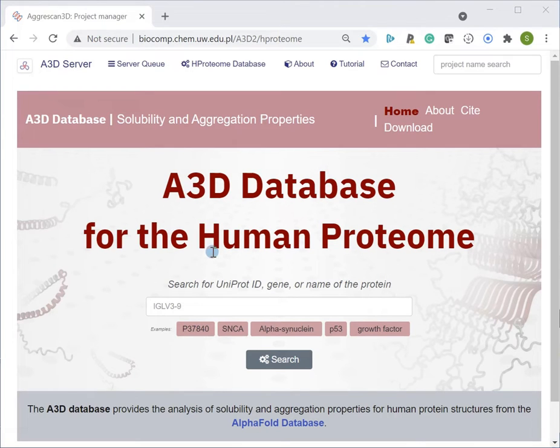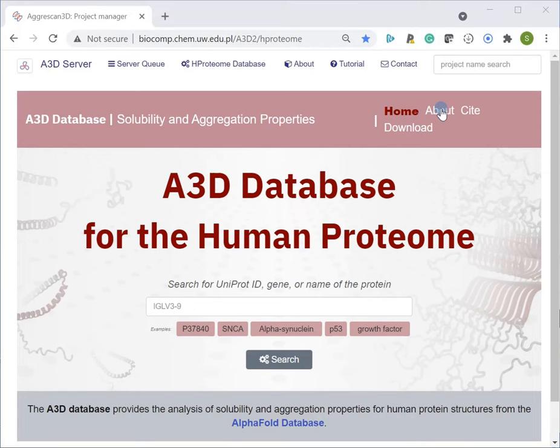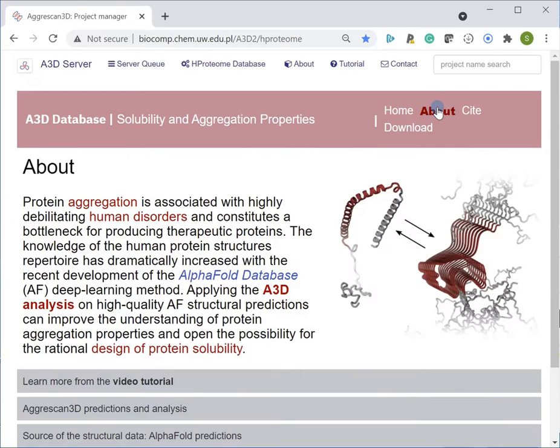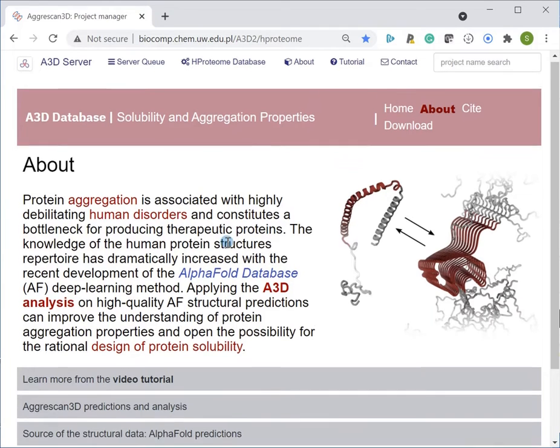The Agreskin 3D database provides predictions of protein aggregation properties for human proteins. The database contains over 17,000 protein structures analyzed using the Agreskin 3D tool. A short description of the database and Agreskin 3D methodology is provided in the online about section.